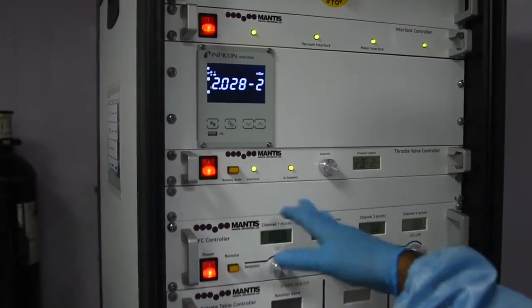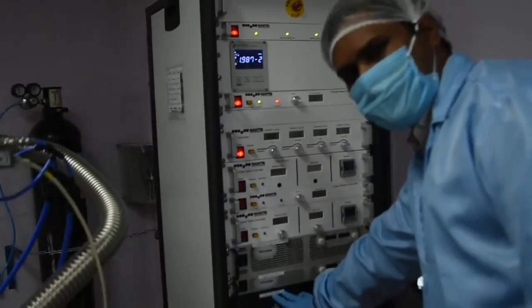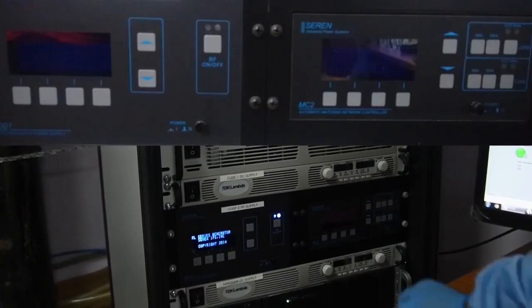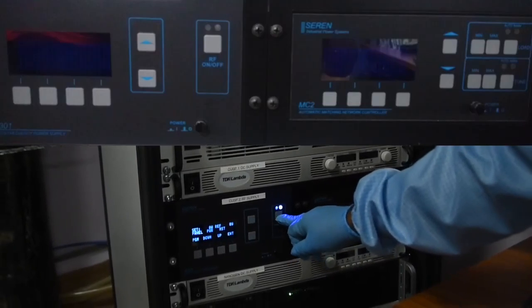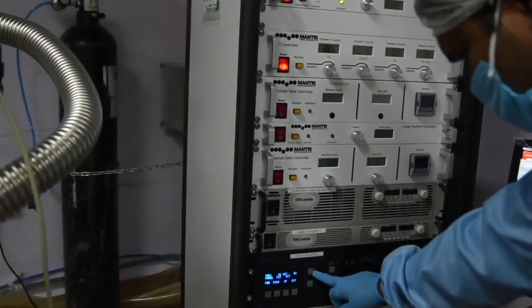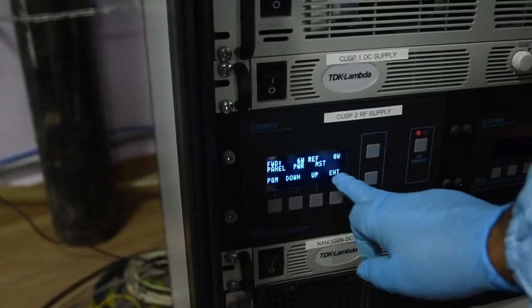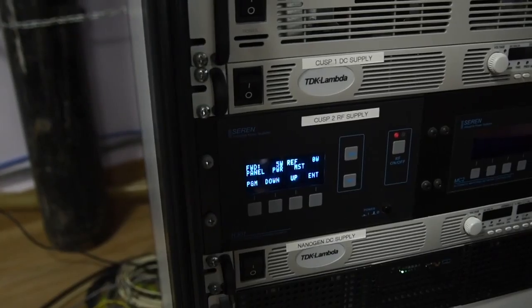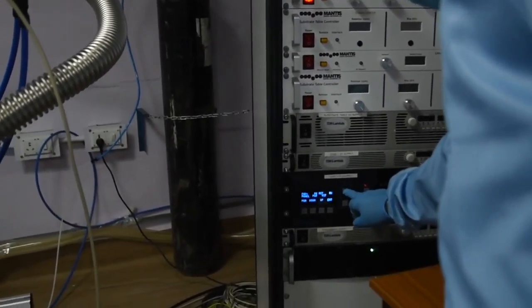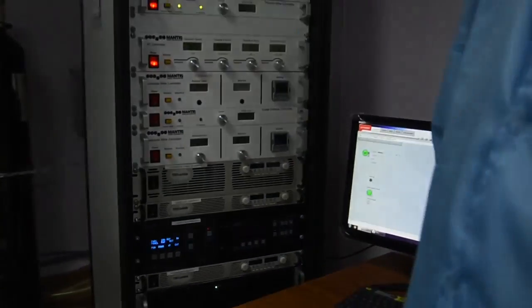This is the RF power supply. We are turning it on, and also switching the on/off toggle to on. Now I am slowly increasing the power in steps — I have increased it to 5 watts, waited a few seconds, and now increased by another 5 watts to a total of 10 watts. We wait for a while at each step before increasing further.